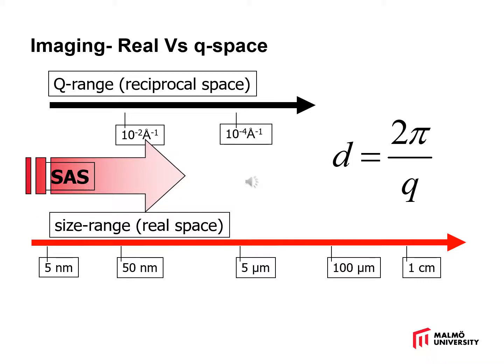Classical small angle scattering typically looks in the size range from nanometers to hundreds of nanometers. Ultra small angle scattering, which is at really small angles naturally, looks from the range of hundreds of nanometers up to microns, at the very edge of what you can see with optical microscopy.